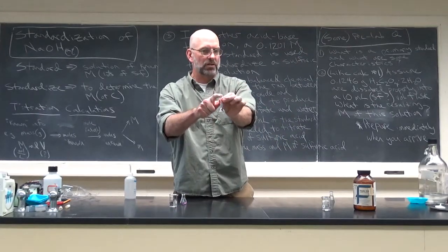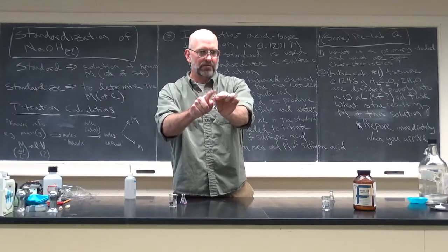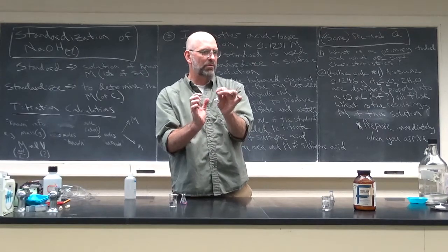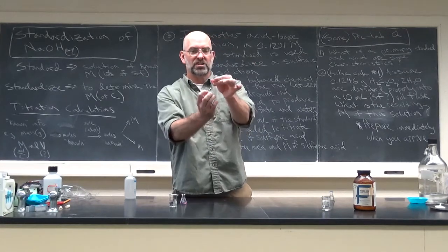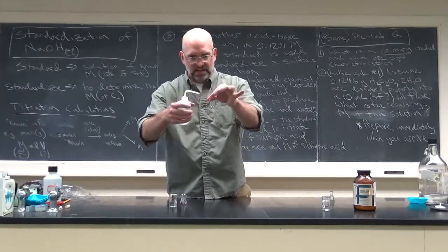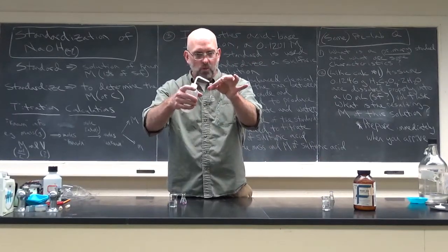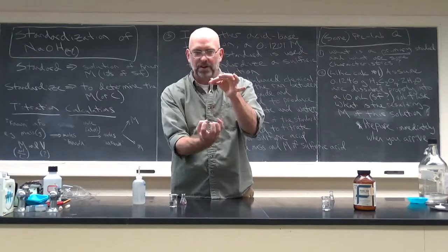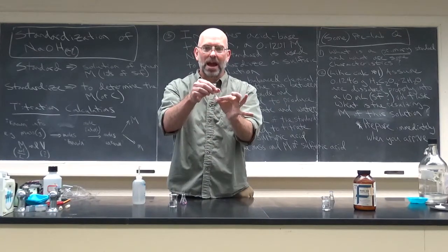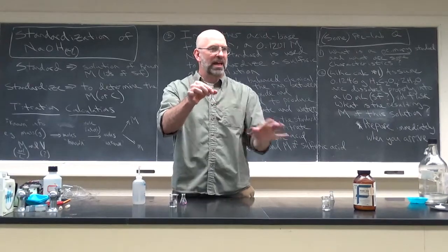Into a 10-milliliter volumetric flask. It's going to be vital that every grain of that solid get into this flask. And then you know how to prepare the solution. I think we've talked about this before. So you put your solid in here. If you need to, the solid gets stuck to the sides. Rinse some deionized water. Wash every bit of the solid down into here, and then fill it up about halfway.